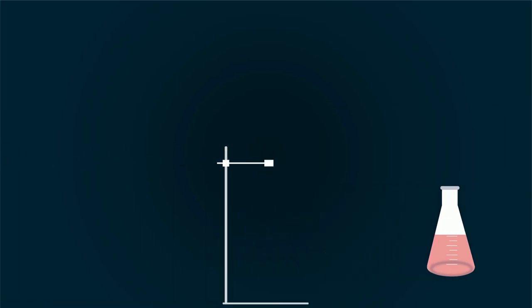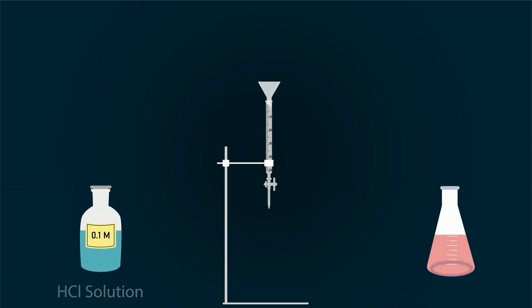Now take iron stand and tie the burette into it. Put funnel on the opening so you can add 0.1 molar HCl. Fill the burette up to the zero point with 0.1 molar HCl solution. Now take magnetic stirrer.